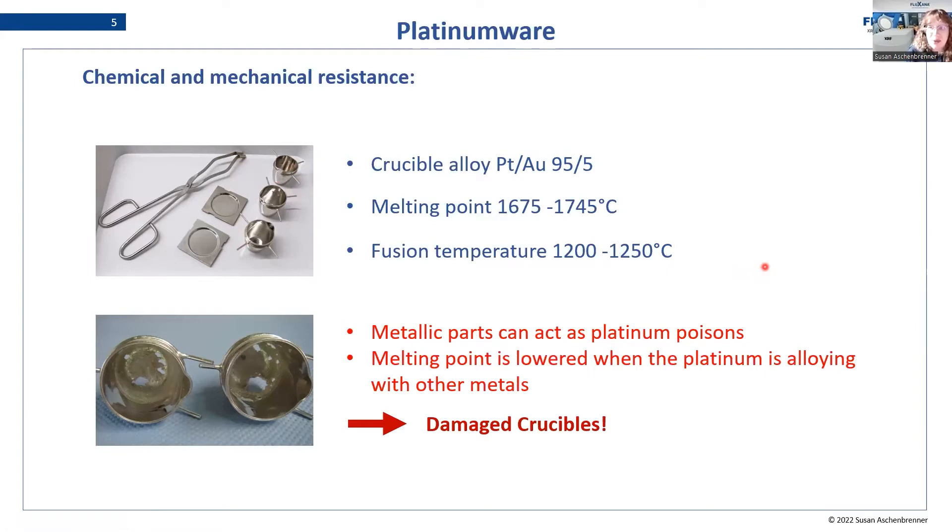We get the shock whenever the machine opens and one of these damaged crucibles comes out of the furnace, and you realize that some metallic parts were in your sample and the fusion didn't work as planned. Obviously this is not what we want because these crucibles cannot be reused — they have to be recycled. Now we could say fusion is not a possibility for ferro-alloys, but that's not the case because if you do it correctly you will prevent your crucibles from being destroyed.